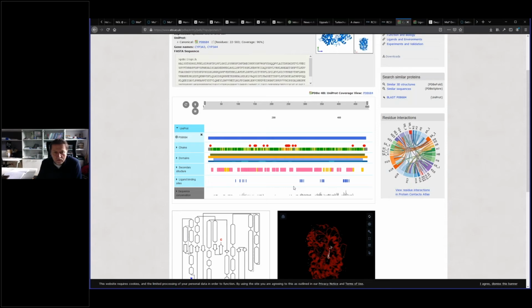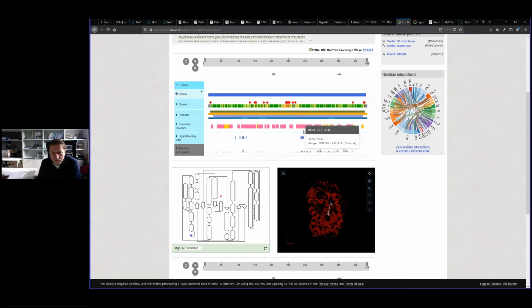So it could definitely be integrated with a sequence view component. If I hover the mouse over a part, it highlights in all the different parts, so yes, it could be embedded into a view like this.